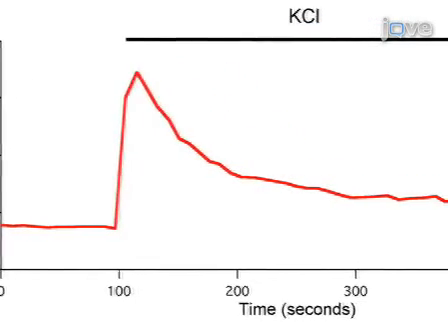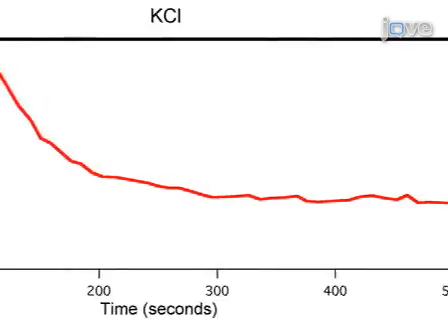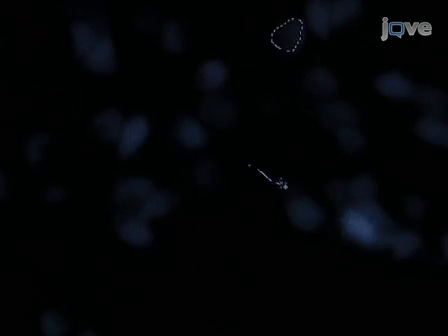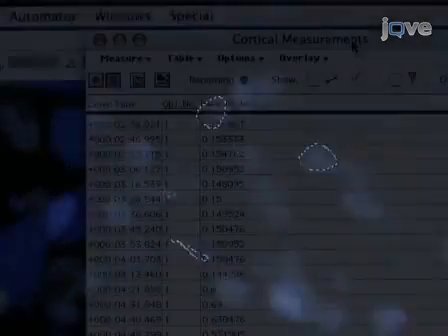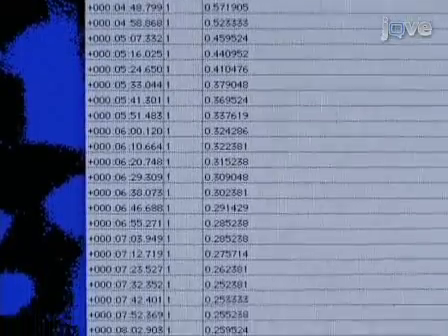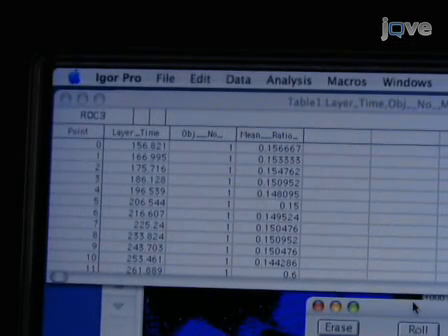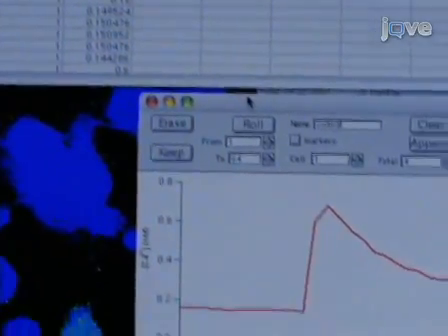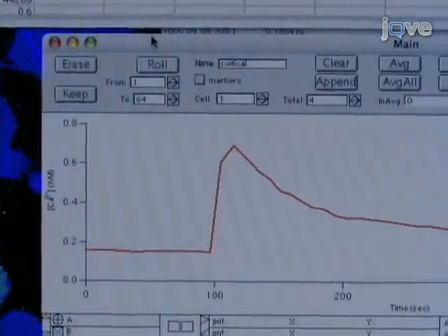To analyze the results of the experiment, convert the set of ratio images into time-lapse calcium measurements for individual cells, or regions of interest within cells. To do this, use the ROI tool to define the areas of the ratio image in which you want to measure calcium. It is generally useful to have at least one ROI that covers the cell body of the cell. Once the ROIs are defined, use the software to collect time-lapse ratio measurements for each ROI in each image. Import the ratio measurements into an analysis program such as Igor Pro in order to convert the ratio measurements into intracellular calcium values. We use a set of macros written in Igor Pro to help carry out the analysis.